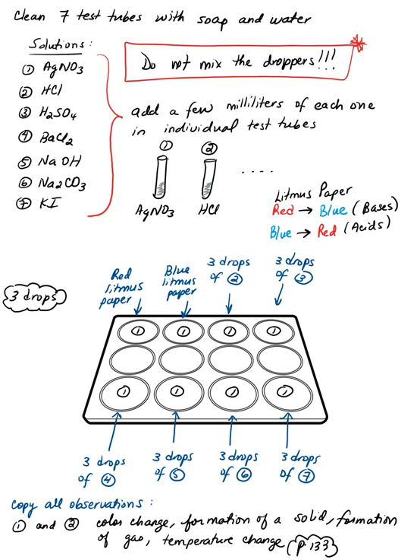Then we're going to prepare the spot plate. So we're going to be using 3 drops. 3 drops for everything. 3 drops for the solution that we're adding in the spot plate, and 3 drops for the solution that we're mixing with what you have.